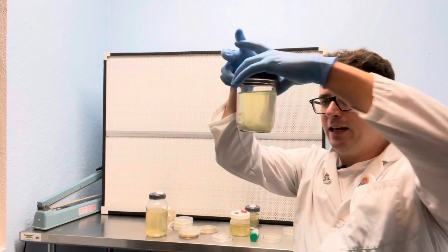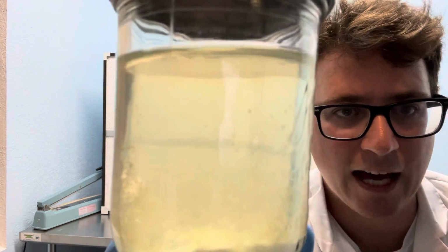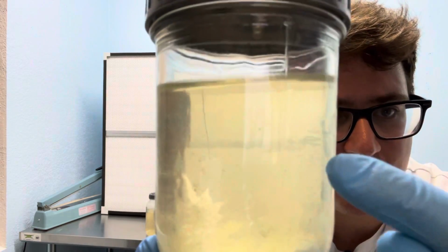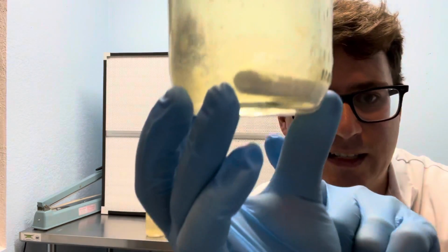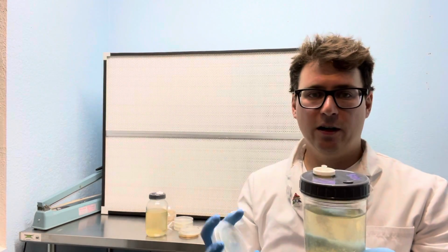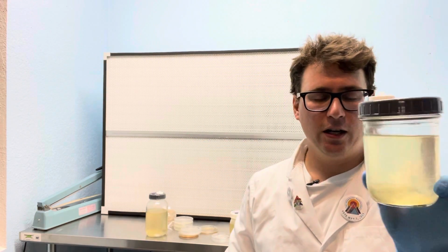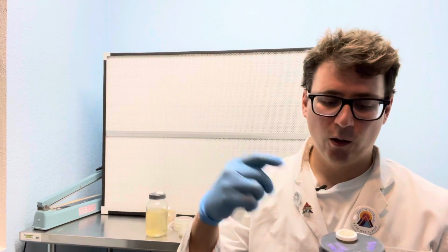This right here is another liquid culture. This is a blonde morel, and you can see these tiny little spherical colonies that are separated away from the big mass of mycelium. So this is actually contaminated as well, and typically it happens either when I'm opening this lid to put my agar wedge into the culture, that's a big risk, or if the needle or the port that I'm injecting my culture into is not sterile, then it can introduce these contaminants.